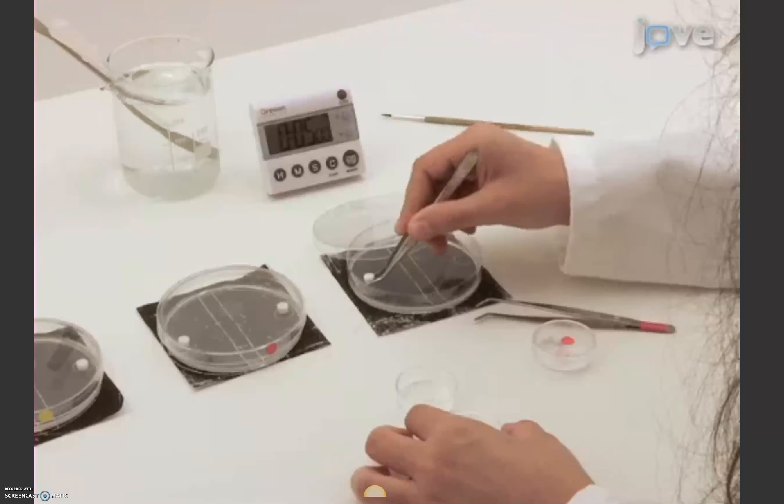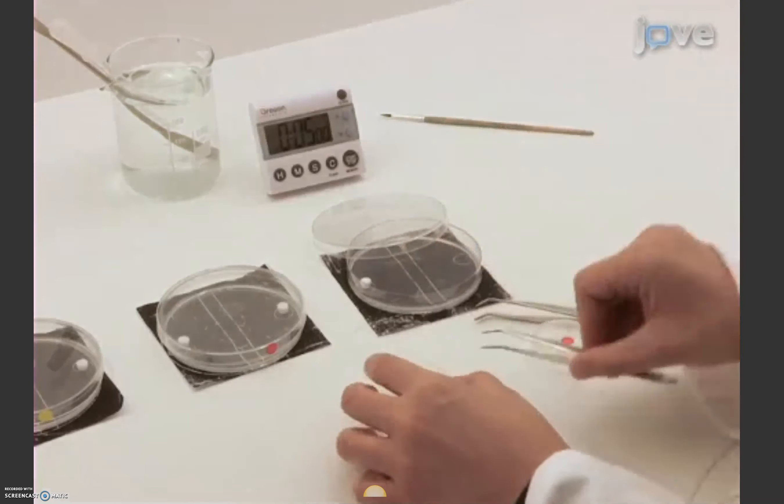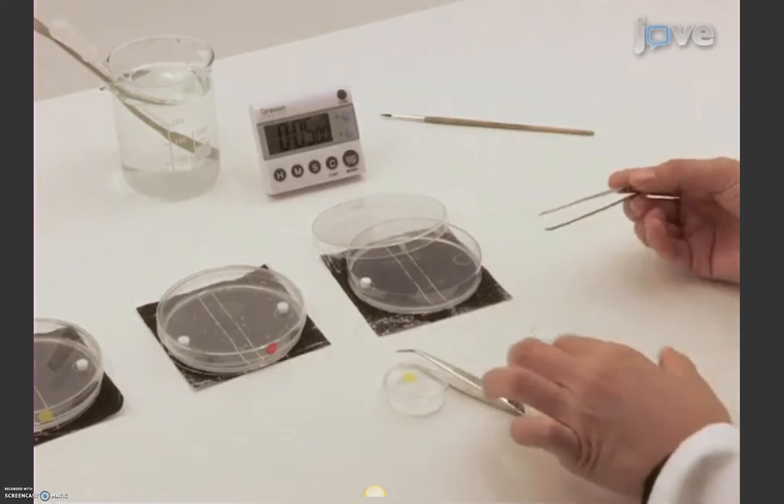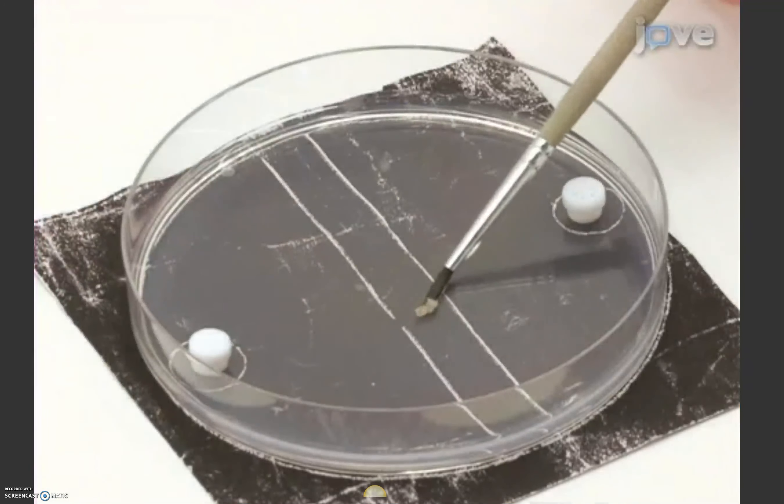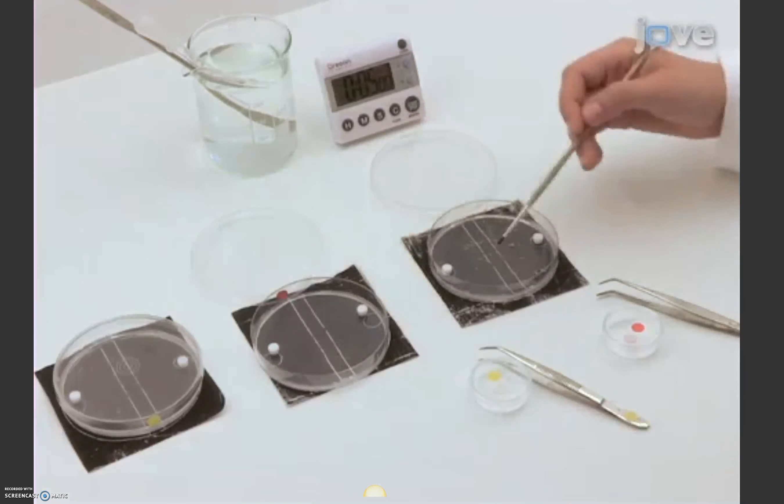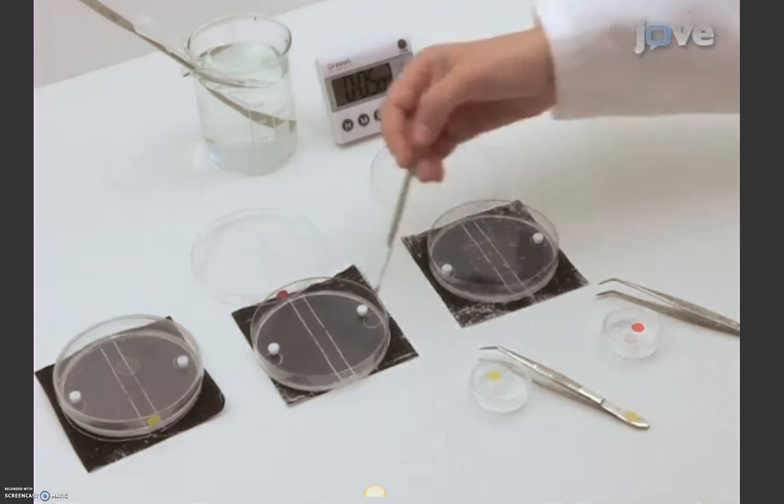For the experimental test, place fresh odor containers, one of each stimuli, on opposing sides of an uncoated, agarose-only petri dish. Transfer the trained animals to the middle of the dish. Close the lid and wait 5 minutes.